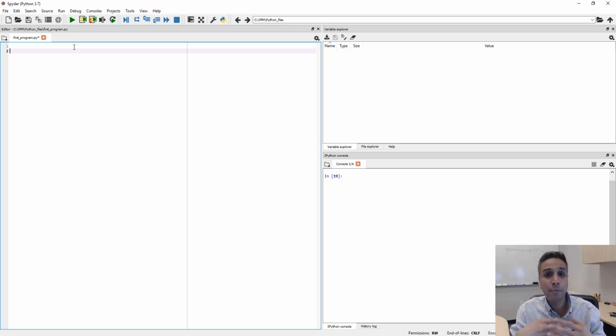And that's because it doesn't just convert an image into a TIFF file, which is okay. I mean, it does convert that. But when you just convert anything into just an image, you lose all the metadata. What is the pixel size? So 20 pixels, is it a satellite image, and does 20 pixels mean like 20 kilometers? Or is this a microscope image where 20 pixels is, let's say, 20 microns or something? So pixel size is very important, and that's where the advantage of OME-TIFF is.